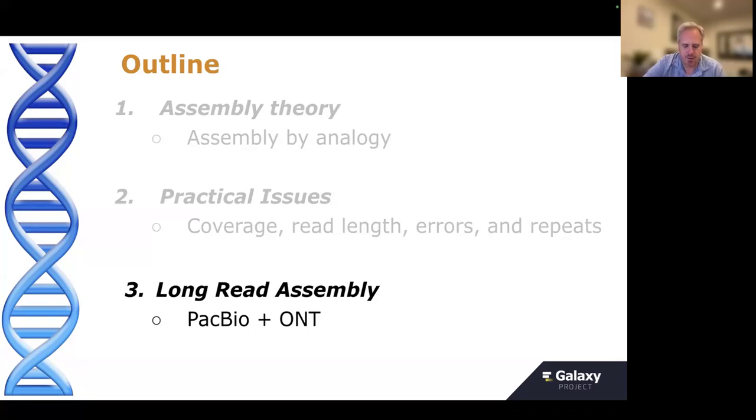Now, many genomes have been sequenced with, say, Illumina sequencing, and yes, you can do de novo assembly of them. There are good tools like SPAdes, which would be my recommendation today. There are good tools available for short read assembly, but because the reads are short, inevitably the assembly will be relatively poor. SPAdes is an excellent assembler given the data that is available. But because mammalian or vertebrate genomes have so many repeats and so much heterozygosity, with short reads your contigs tend to only be a few thousand to tens of thousands of bases long, compared to the lengths of the chromosomes that are tens of millions or hundreds of millions of bases long. So there's been a lot of interest to improve on de novo assembly.